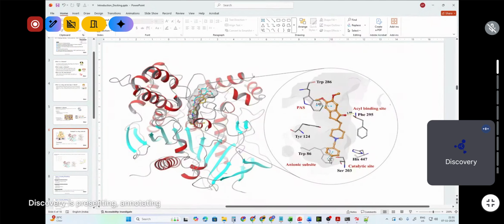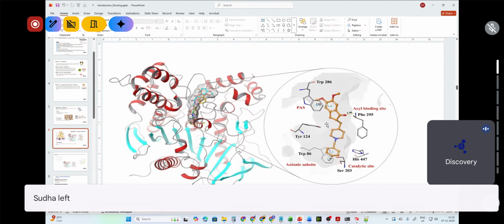So if I'm able to calculate the central point or the center of this Donepezil, or the drug molecule, the center point will be somewhere here. So that means it will also be the center point of this active site pocket.